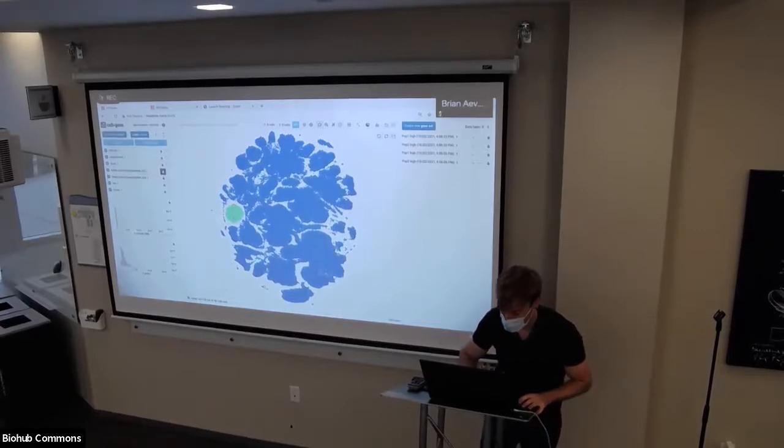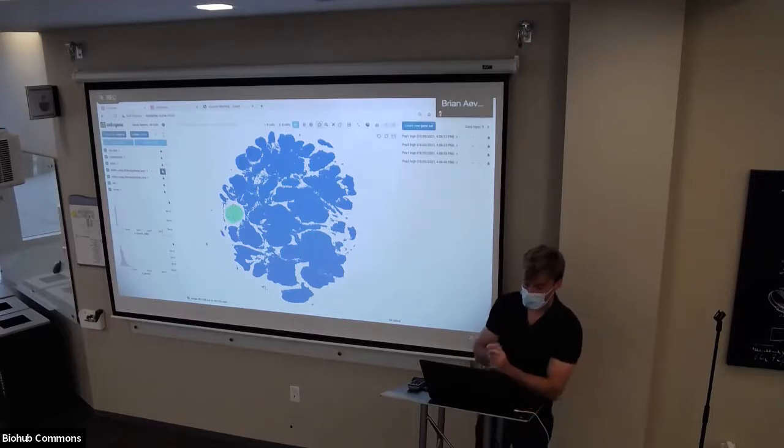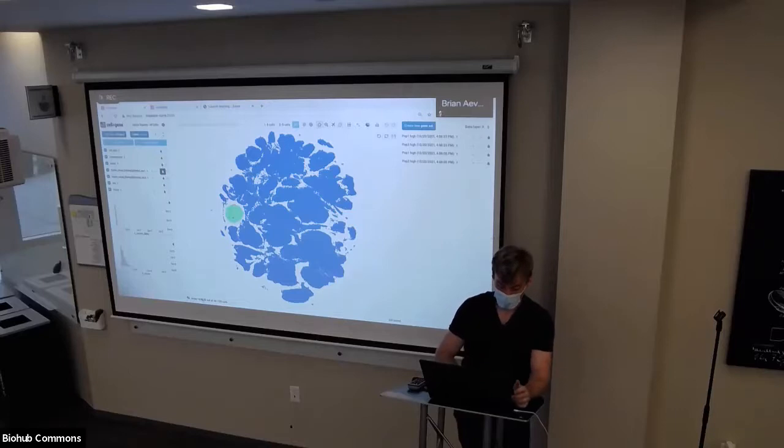But yeah, so now we have these cell types located there. And you can go further. You don't just stop at one view.